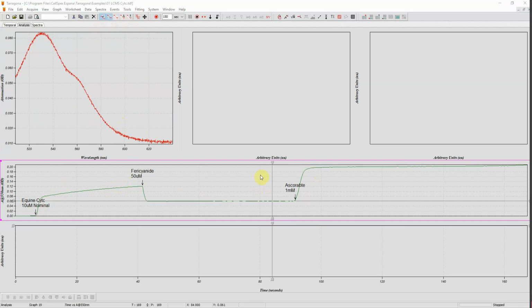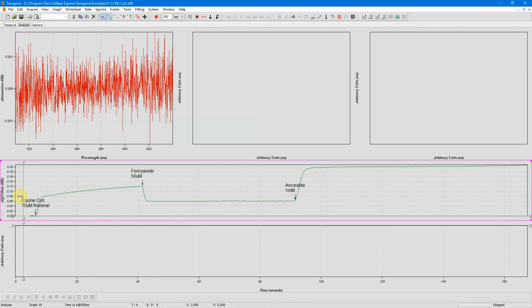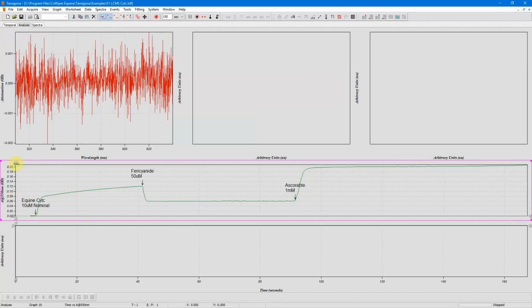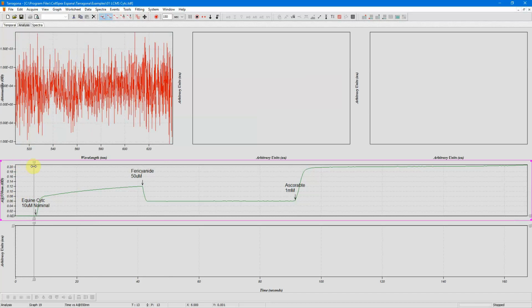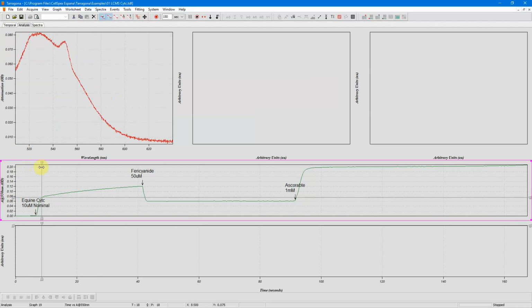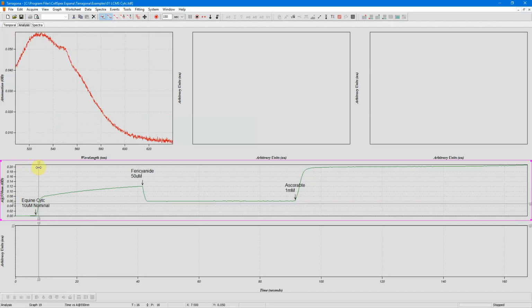Cytochrome-C comes in two forms, the oxidized form and the reduced form. The reduced form has a strong peak at 550 nanometers, which is why I chose to extract the attenuation at 550 nanometers. If you go to the beginning of the experiment, there's no signal here because I just have buffer in the system. At this point I added 10 micromolar of cytochrome-C from Sigma, and you can see the spectra changes. It's mainly in the oxidized form, but you can see a small peak at 550 here.